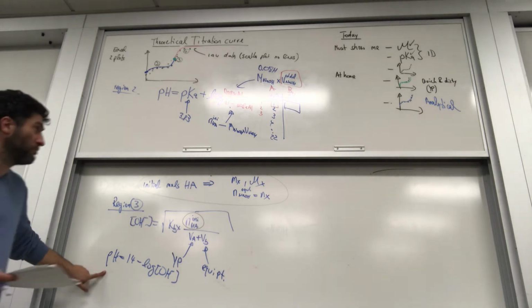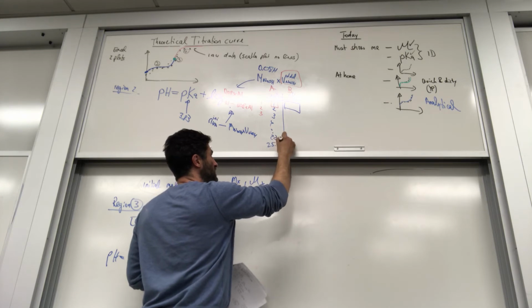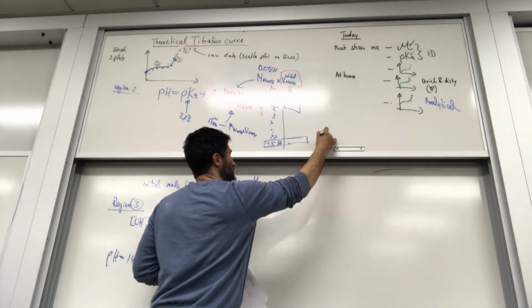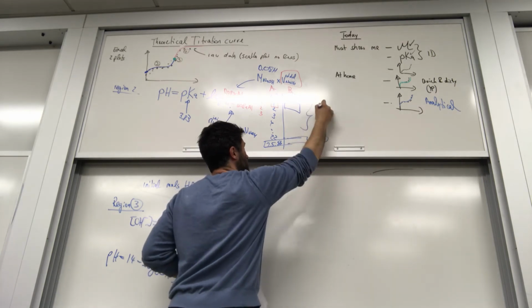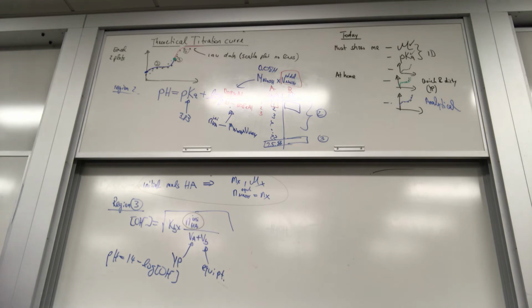So this number you can manually enter at 25.86 milliliters, and then whatever that number is. So this is region 3, this is region 2 in my Excel table. For the first equation, we would just drag it to the right and forth.